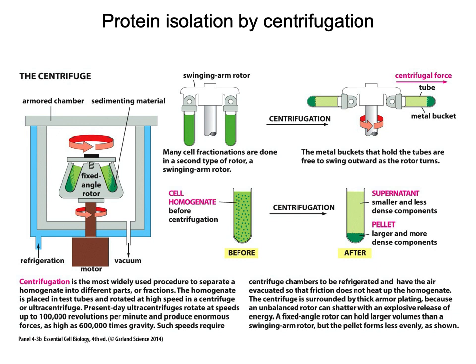And after centrifugation, what happens is any of the smaller, less dense components, like the liquid of it, is going to stay up towards the top. And then what we would have is the pellet, and the pellet's going to be where our denser material is.